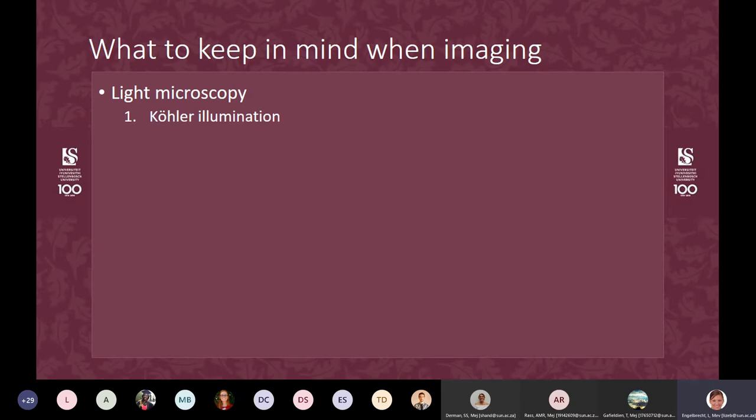How do we get light microscopy images to be consistent across different days, across different experiments? The first thing, and Anya said this in one of the first webinars, so if you are not sure how to do the Köhler illumination, it is in the first webinar of this series. Köhler illumination makes sure, firstly, that your condenser is in focus, and secondly, that your field of view is centered. If it's not centered, you could get shadows on your image, and that would be very difficult to deal with. So Köhler illumination is one.